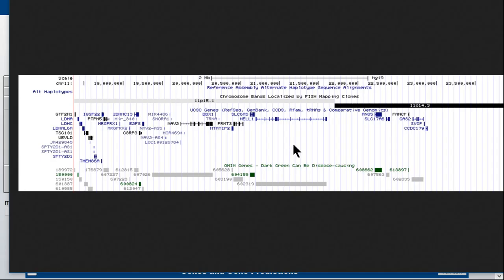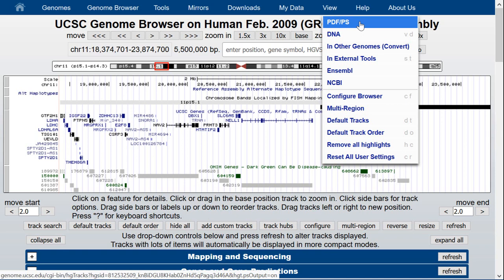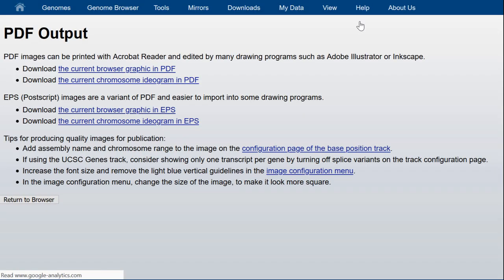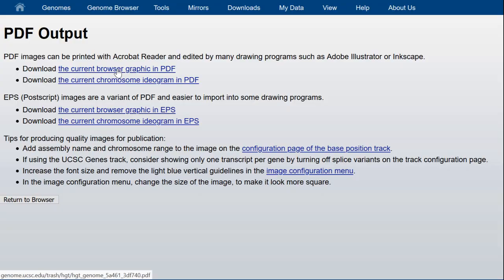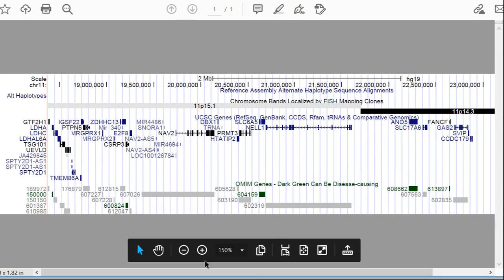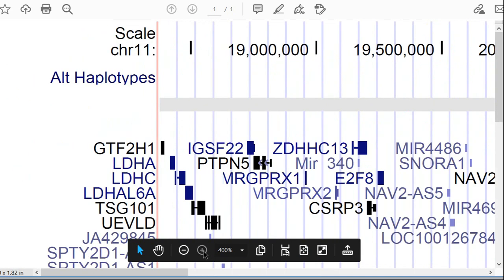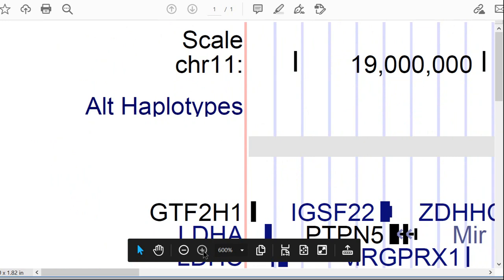There is another way to view the image, which is useful for getting a graphic for publication required to be at much higher resolution. If you click the PDF/PS link in the view menu, you are able to download the current browser graphic in PDF format. Opening it with Adobe Acrobat gives you a PDF version that can be viewed at very high resolution. Because it's vector graphics, it doesn't get pixelated when you zoom in. You can save this and open it in an application such as Photoshop, where you can modify the resolution and save it at 300 dots per inch or even higher.